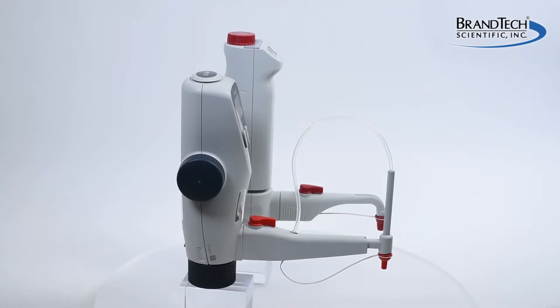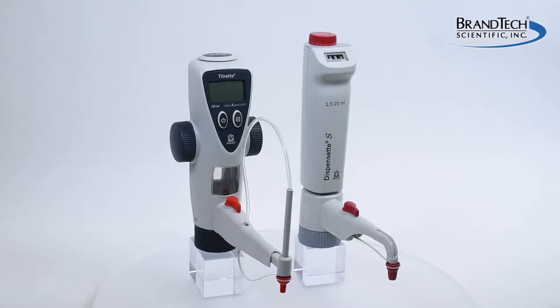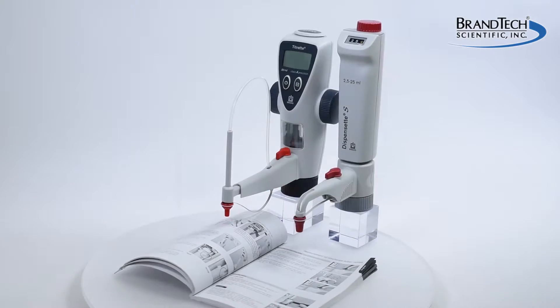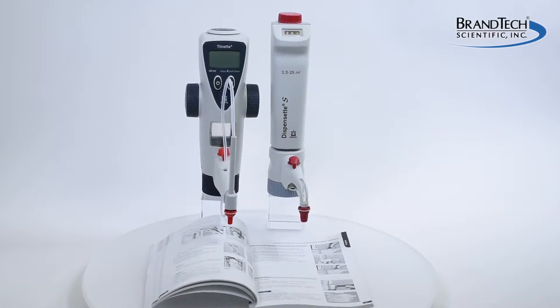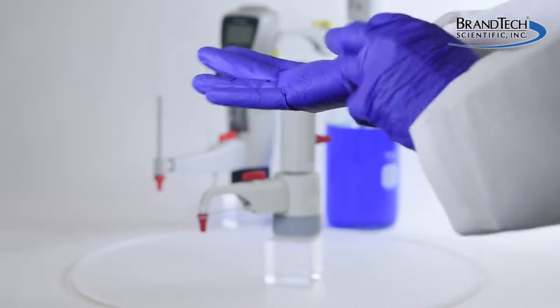This video demonstrates how to install and remove a discharge tube for all models of the Dispenset S bottle top dispenser and the Titret bottle top burette. It is intended as a general guide and is not a substitute for your operating manual. Wear all the appropriate personal protective equipment and observe all safety precautions.